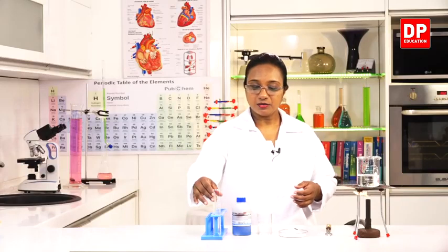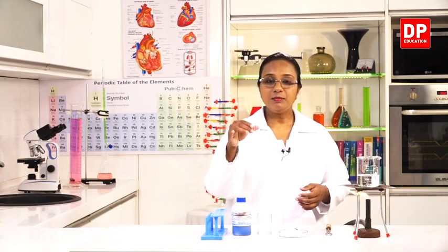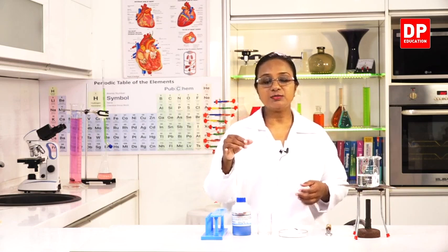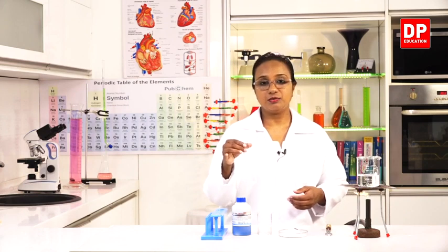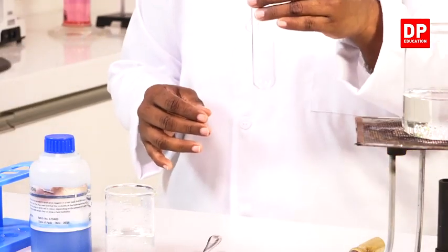So to prepare the glucose solution, I will need a boiling tube. We will be using a boiling tube because we have to heat the solution. First, I will prepare a solution of glucose in a boiling tube.